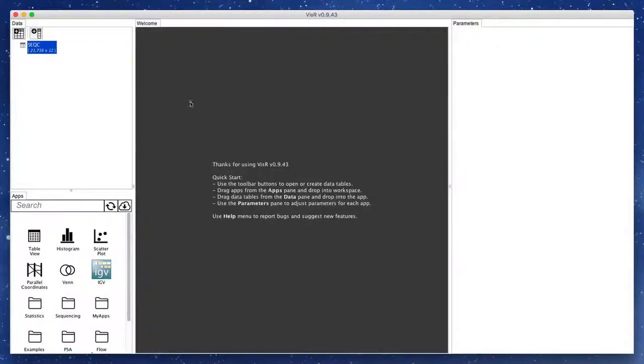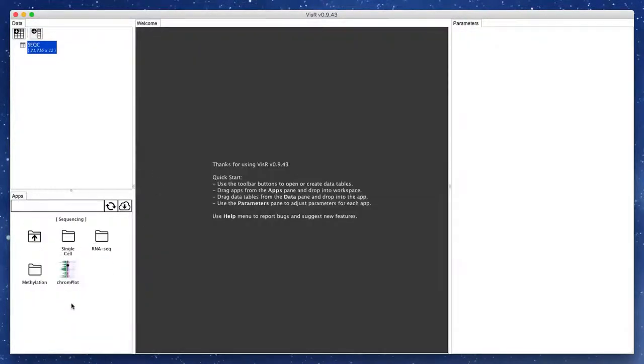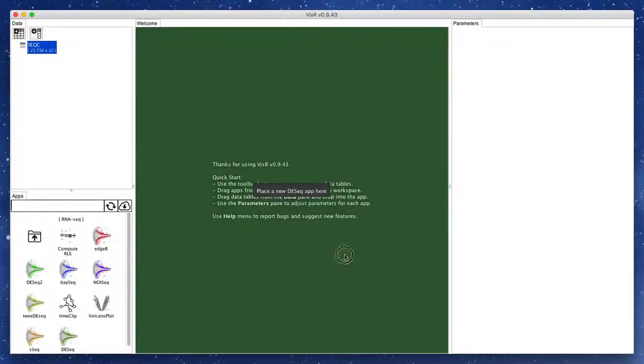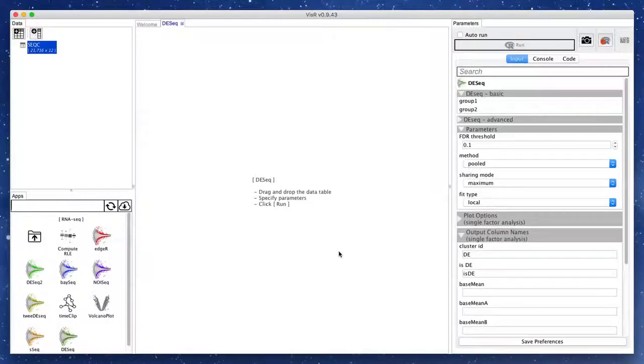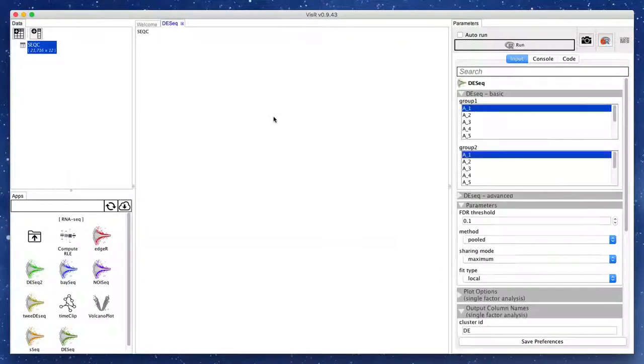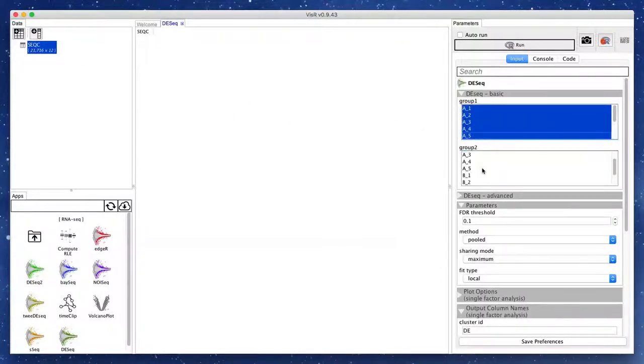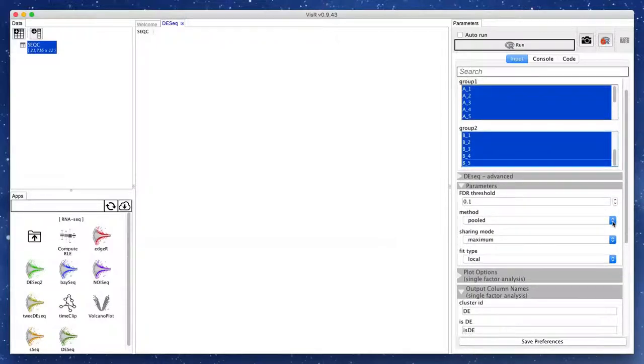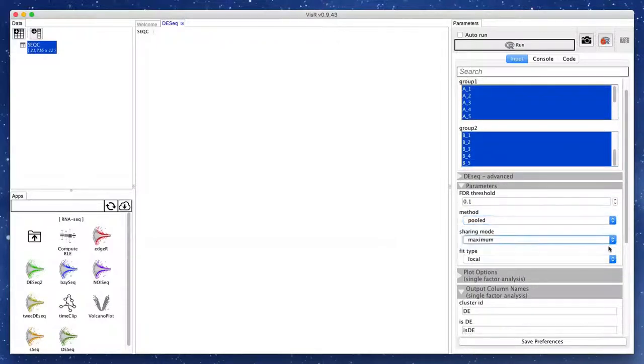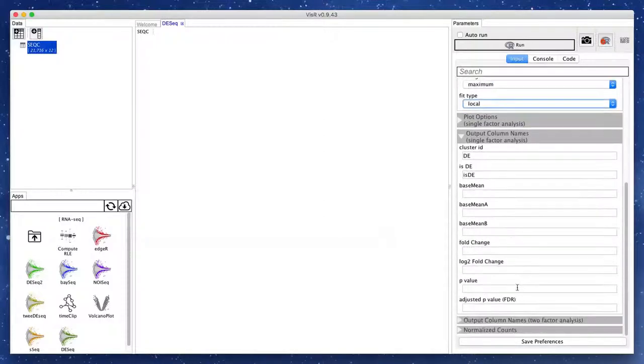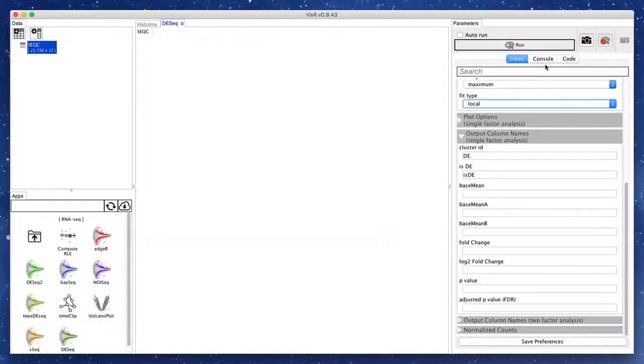To perform differential expression analysis, here we use an app that uses a popular bioinformatics method called DESeq. We first add the app to the workspace and drag and drop the data table. We then specify the data columns corresponding to each biological condition. DESeq takes several other parameters, but we will leave them to the default values for the time being. Click the run button.